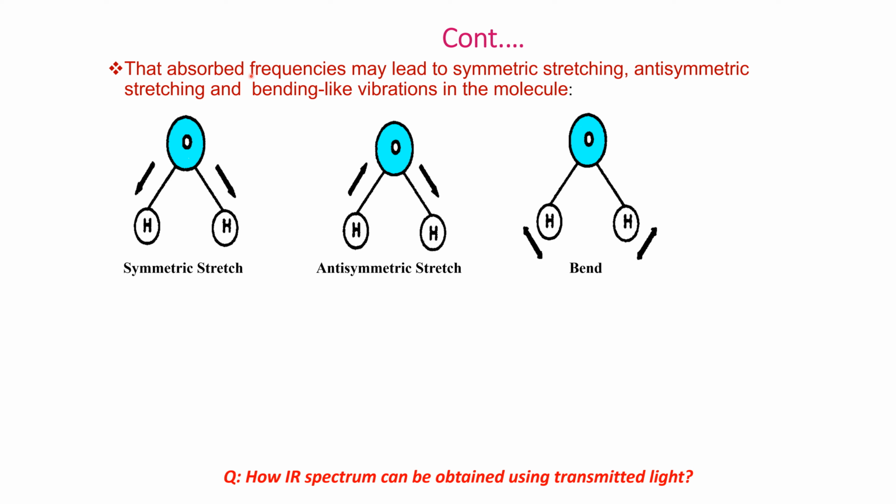The absorbed frequency may lead to symmetric stretching, anti-symmetric stretching, and bending vibration in the molecule. There are also other vibrations like rocking, twisting, and wagging.